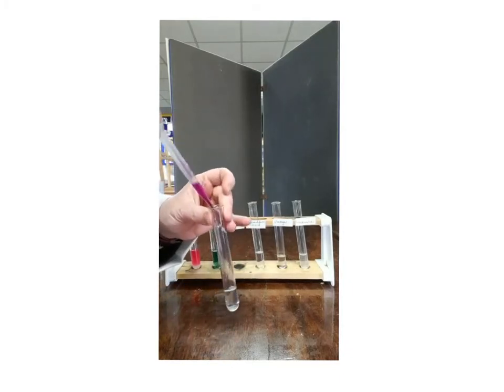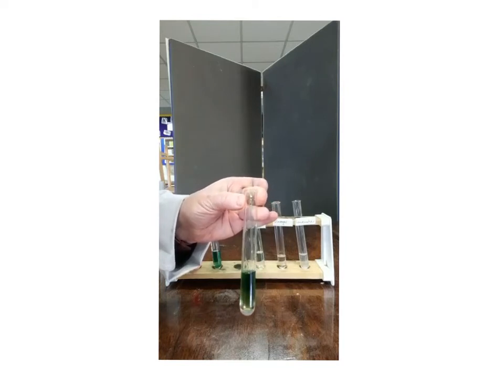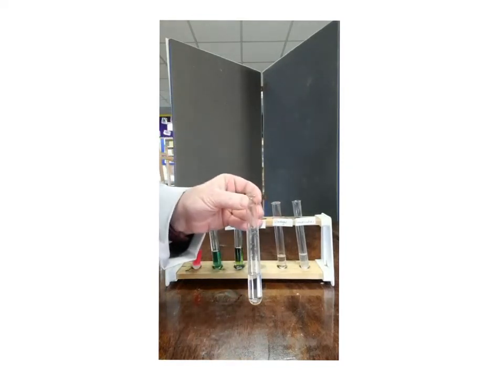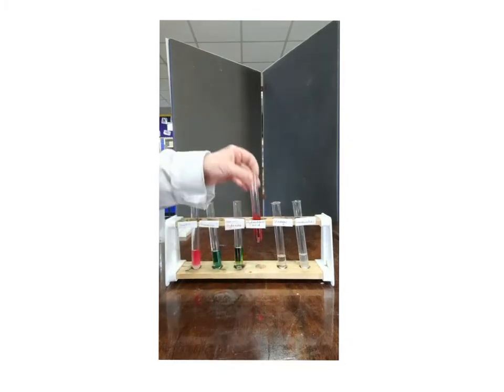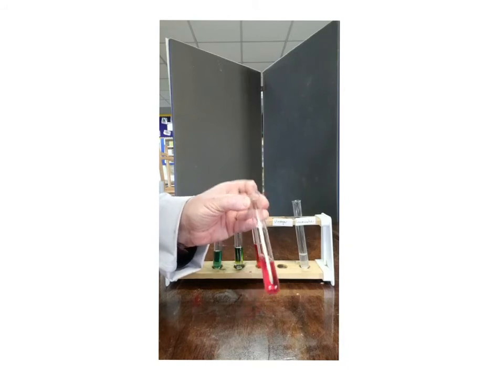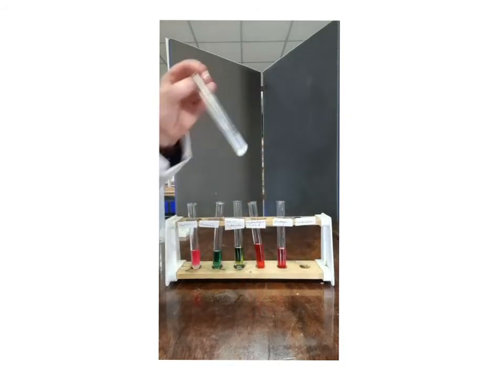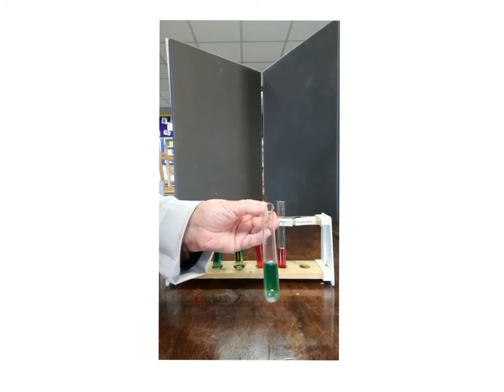Into sodium hydroxide, we have a dark green. Into hydrochloric acid, it has turned the acid red. In vinegar, the homemade indicator has turned the vinegar a pinky red. And finally our lime water, our homemade indicator, has turned a greeny blue colour.